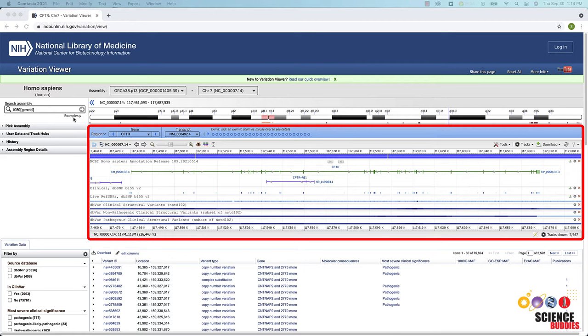Now that you know how to search for nucleotide and protein sequences, genes, and gene variants on the NCBI website, you should be well equipped to get started on your own genomics research question. To get ideas for genetics or bioinformatics science projects that use the NCBI website, or thousands of other science and engineering projects, visit us online at www.sciencebuddies.org.